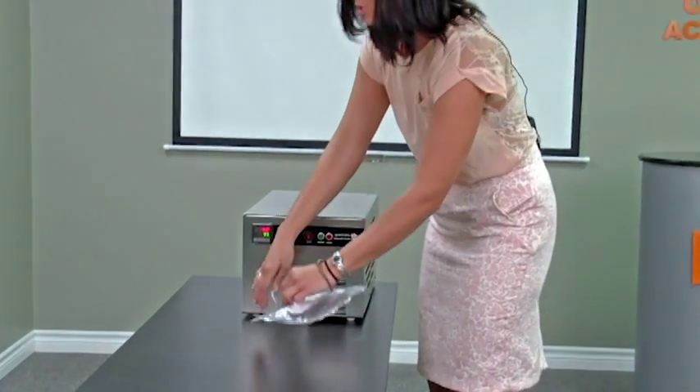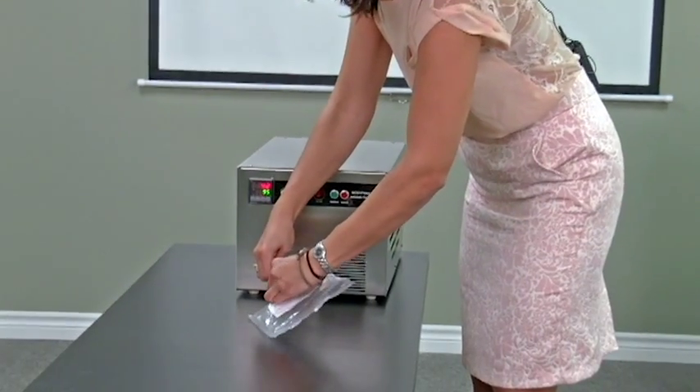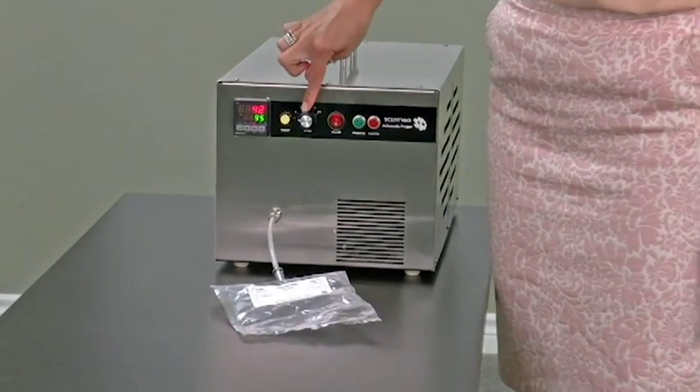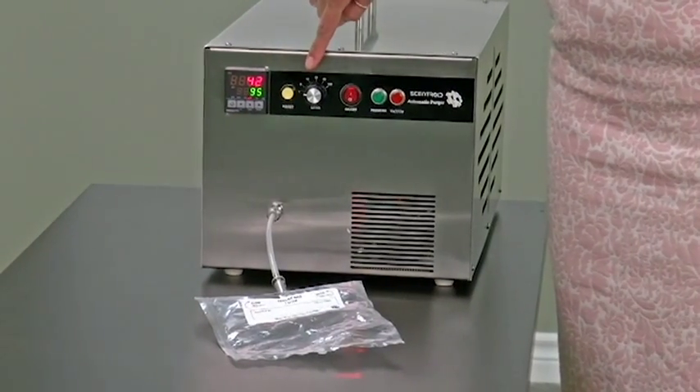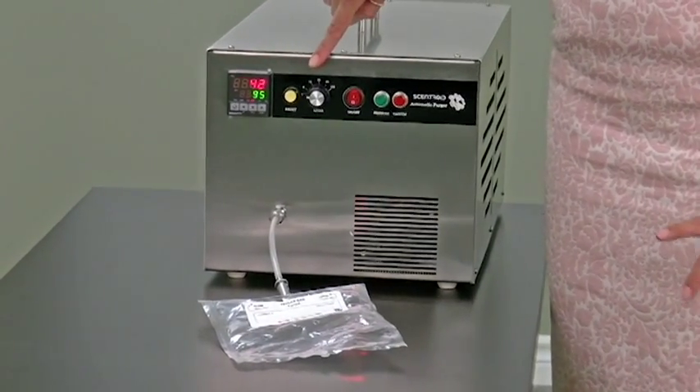This unit works on the pretense that it pushes hot air into a Tedlar bag and then vacuums that same hot air out. This removes any chemical compounds or molecules that may have contributed to the background odor.